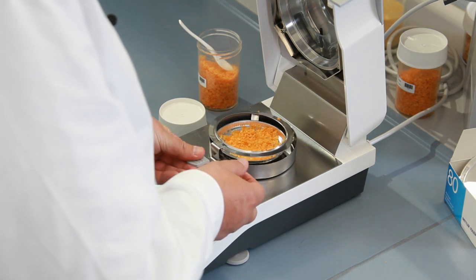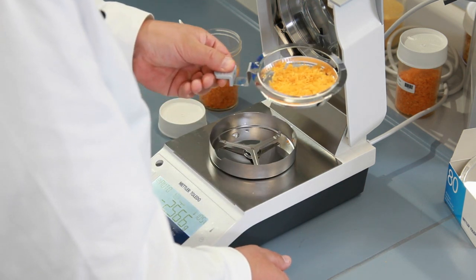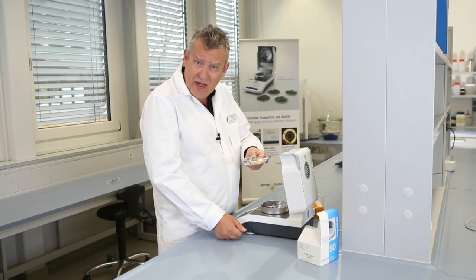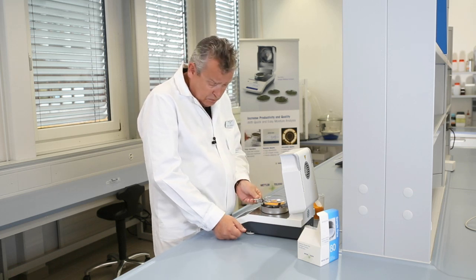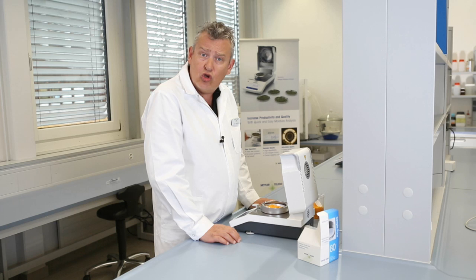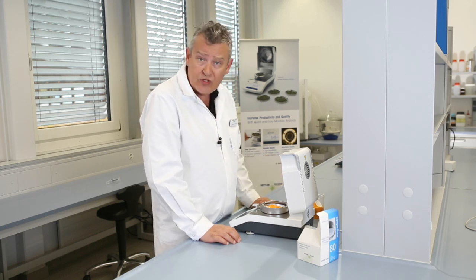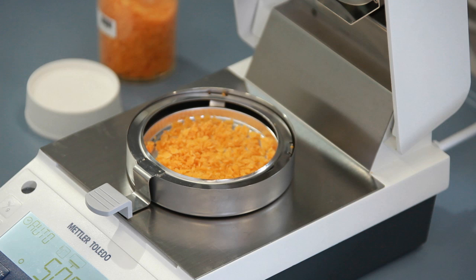It's important to spread your sample evenly around the pan so that you end up with a thin and even layer. This ensures uniform sample drying, and it may be necessary to crush or grind up the sample before you start to measure with it, as I have done here with these potato crisps.